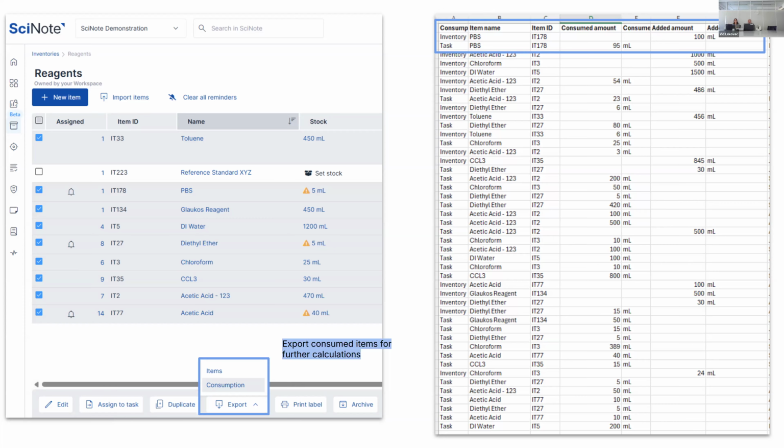And we can show you how to do it. We will be happy to show you how to do it in the training sessions. We have office hours, we have support systems, but the important bit here is that it comes from within the company, within the organization. You need to tell your team, and it needs to come from above as well, why it's important.